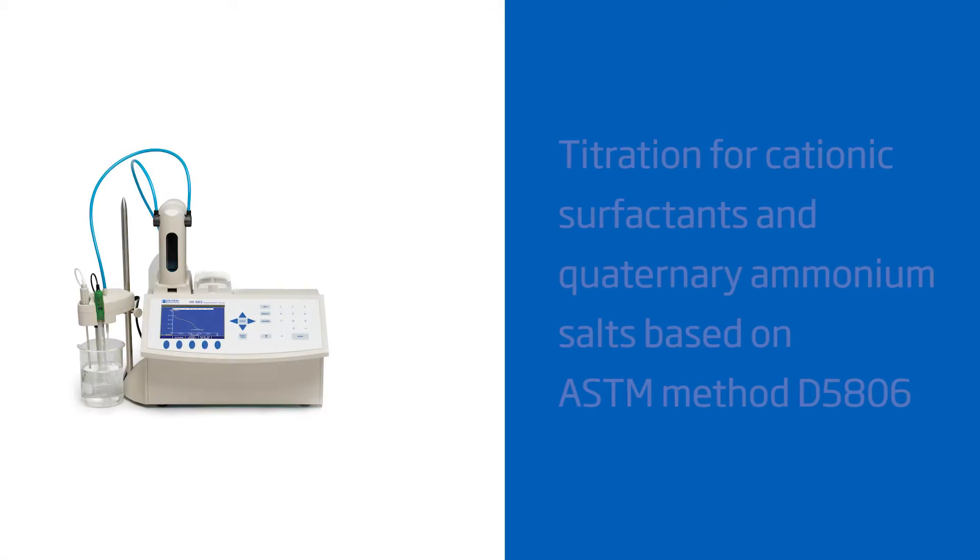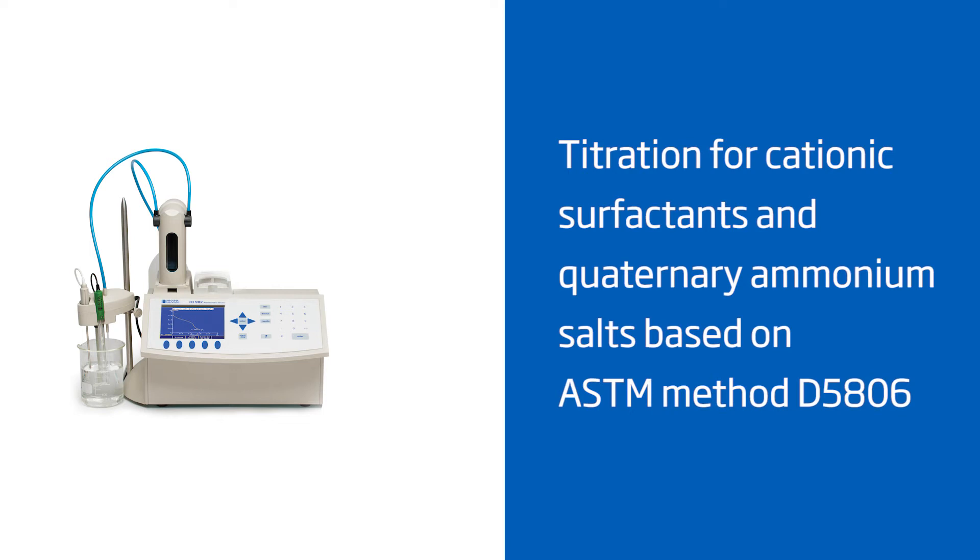Now, let's go into the lab and run some samples. First, I'll show you how to run a titration for cationic surfactants and quaternary ammonium salts based on ASTM method D5806. These surfactants are found in many commercial sanitizers, so testing is very important to ensure a consistent quality product.